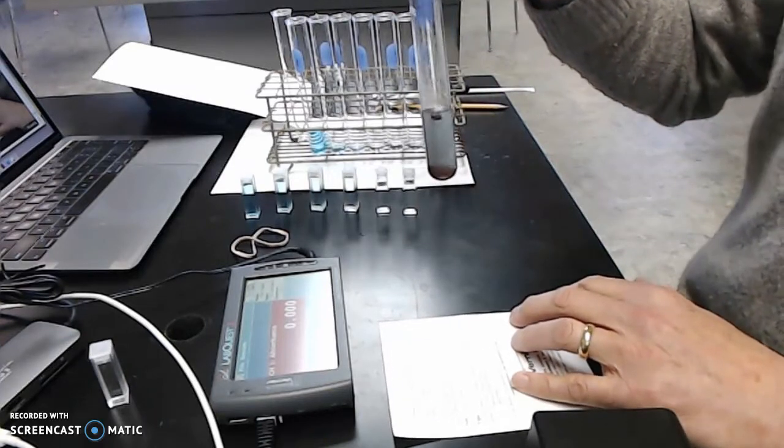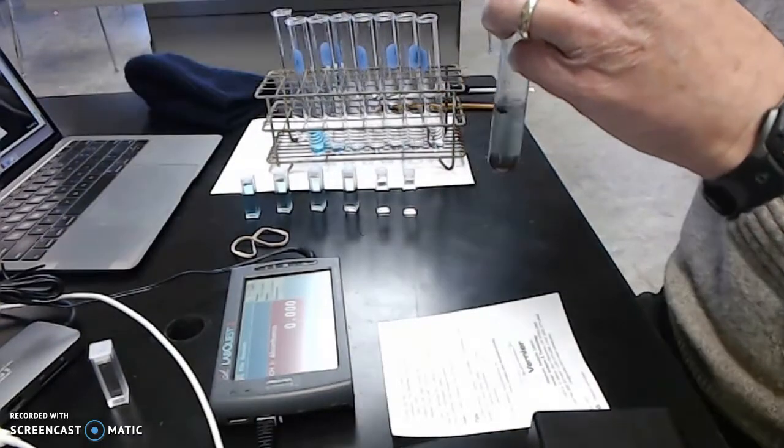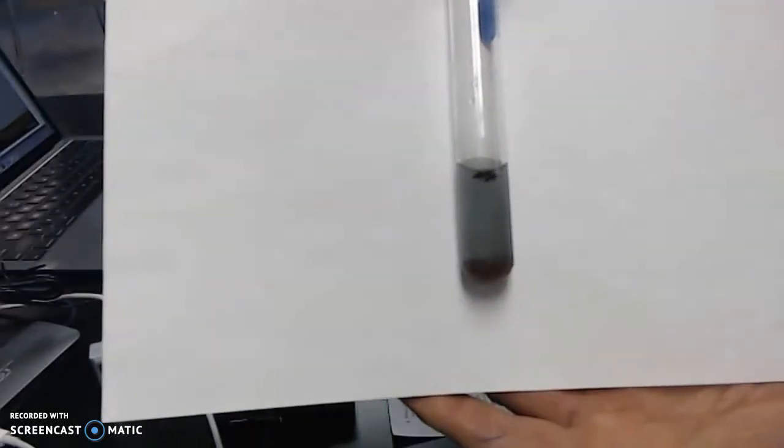But I do want to show you the progress of the aluminum and the copper chloride. I'm going to put this white sheet of paper behind so you can see what's going on. I'm going to do the extreme close-up. You can see at the bottom there is some copper metal that has been produced, and up at the top there's this really stubborn piece of aluminum that is still reacting.